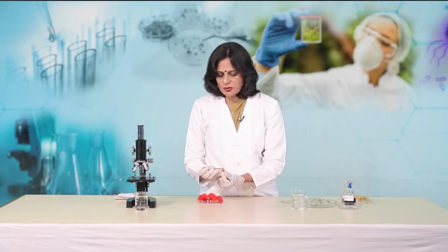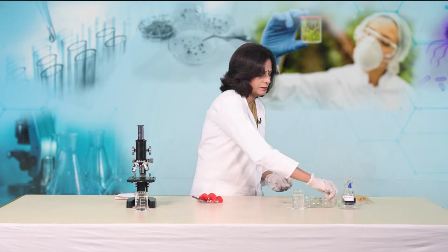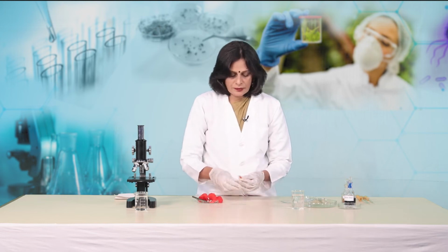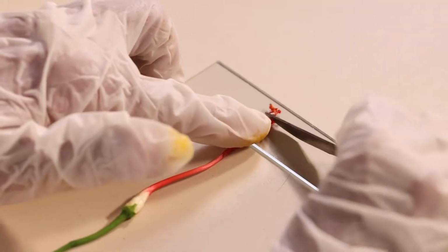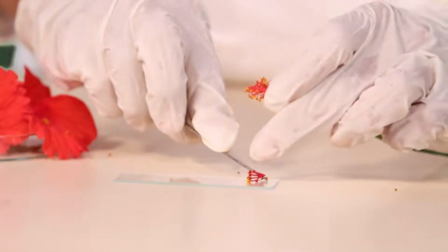So, with the help of the scalpel, we will transversely cut the stigma and place it on this micro slide.